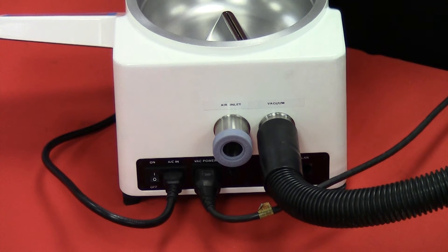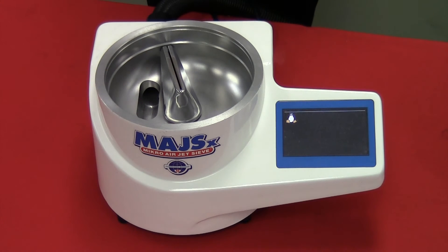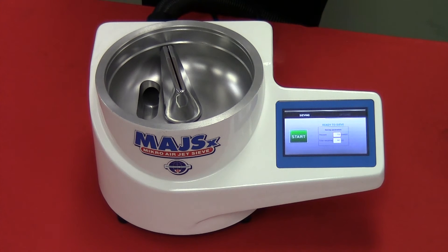That noise that you just heard is the modulating pressure valve adjusting. As the unit is powering up, the software is going through a self-test procedure. Once the ready to sieve screen is displayed, the Hasekawa Micro Airjet Sieve Model X in the basic version is ready to be operated.